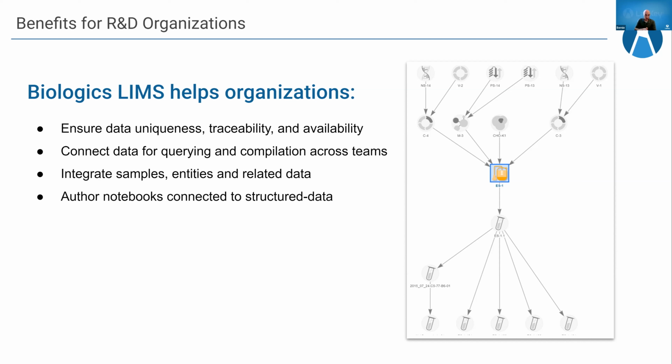Then there's authoring notebooks connected to structured data. You may have heard at a previous webinar or in Hannah's presentation yesterday, the phrase data connected ELN. Notebooking I would categorize with death and taxes. This is totally inevitable. You have to document your work. It's a fundamental component of the scientific operation.